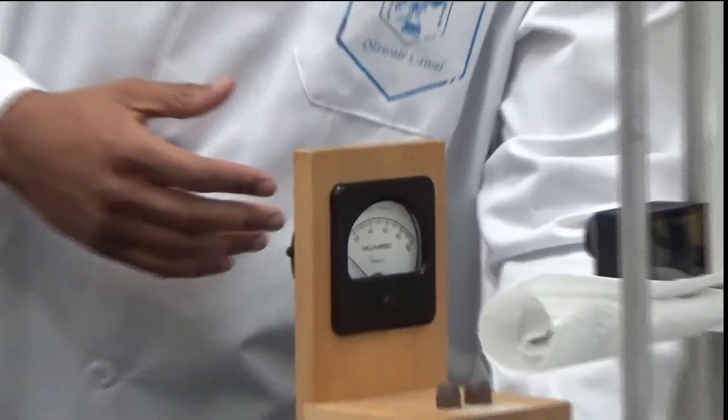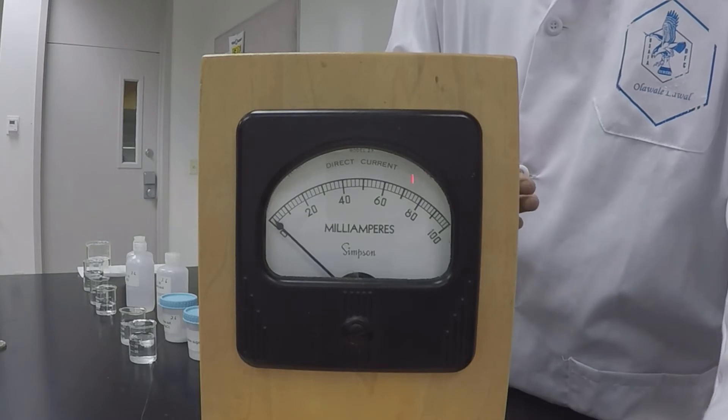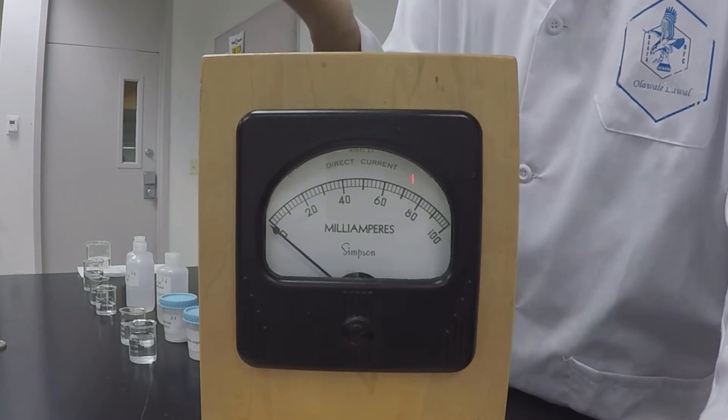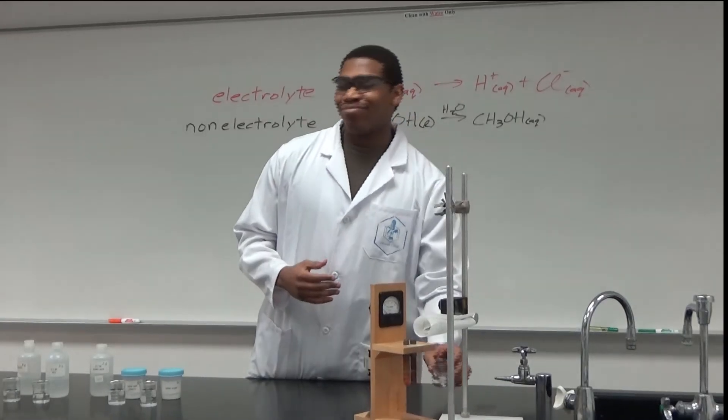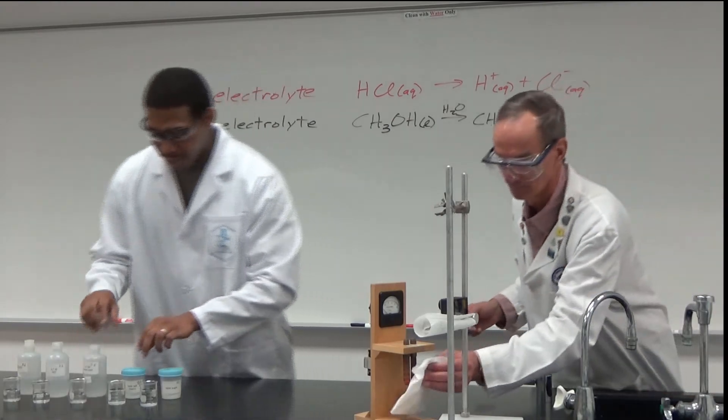As I place this in the meter, we can start to see a little bit. If I move the solution up and down, out of the meter and into the meter, you see the arrow kind of go back and forth. But really, similar to the tap water, it's not that conductive.